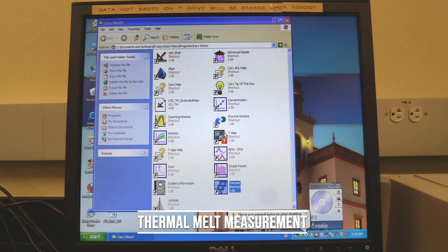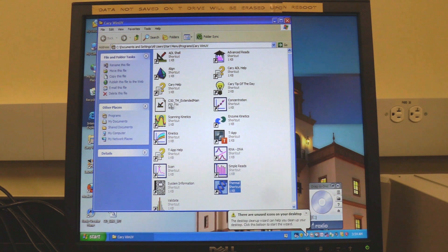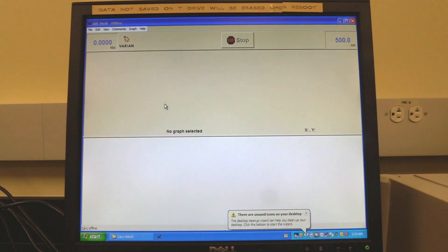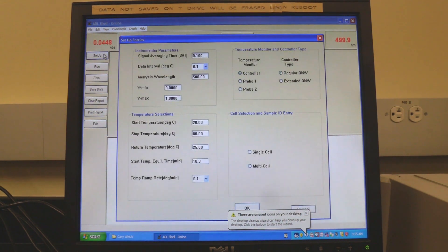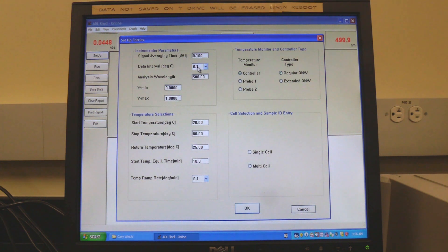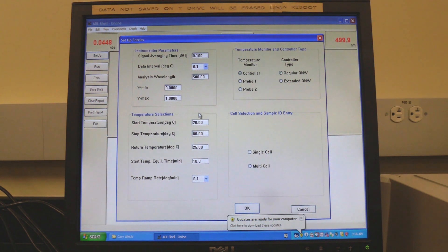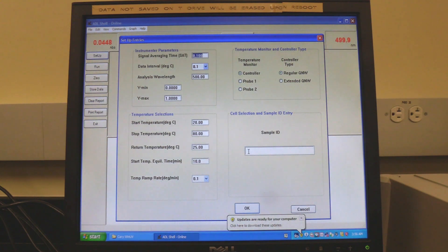Thermal Melt Measurements. In the Cary Win UV folder, double-click on the C50TM Extended Main icon. Wait for the software to open and initialize. The instrument will be finished initializing when the absorbance reading turns red. Click on Setup to set measurement parameters. In Instrument Parameters, set the signal averaging time, data interval, and analysis wavelength. In Temperature Monitor and Control Type, select Controller and Regular QNW. In Temperature Selections, set Start Temperature, Stop Temperature, Return Temperature for End of Run, Equilibration Time, and Temperature Ramp Rate.